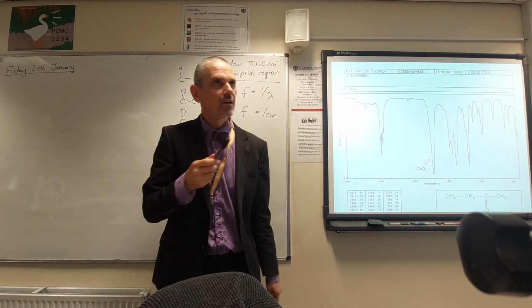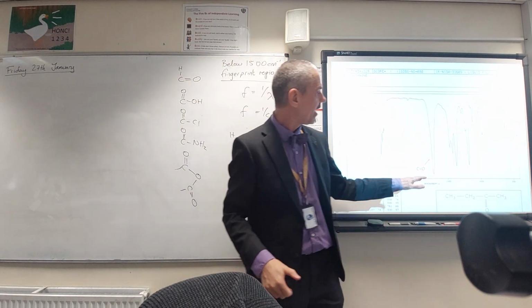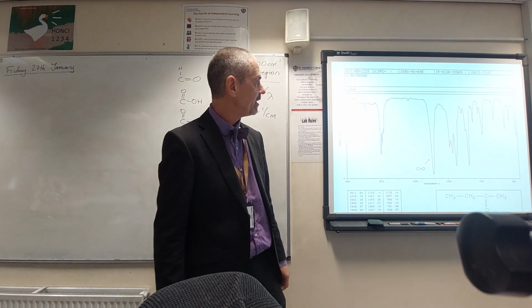So the important thing is to be able to get a feel for what a peak should look like. We've looked at OH, carbonyl, C double bond O, good strong sharp peak middle of the spectrum.